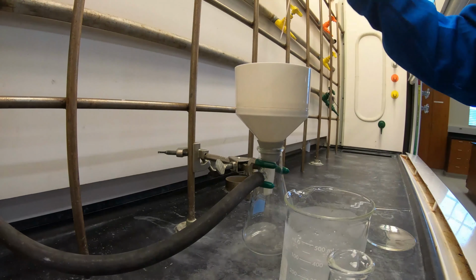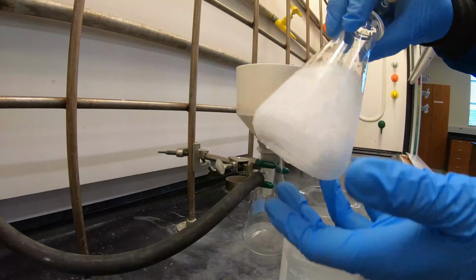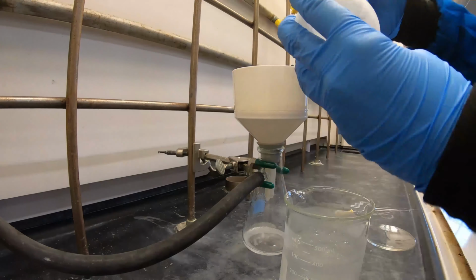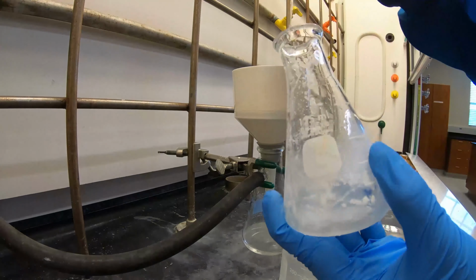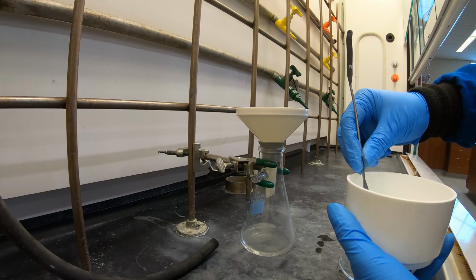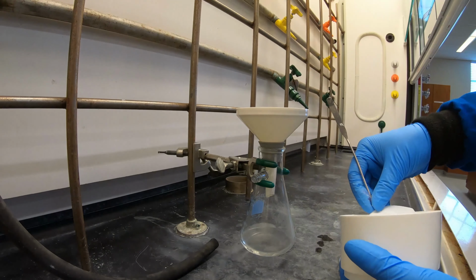Dampen the filter paper using cold water, and then filter your crystallized product. Use your spatula to scrape over as much product as possible, and then rinse with cold water. Continue to pull vacuum to air dry your product, then weigh your aspirin to obtain the purified yield.